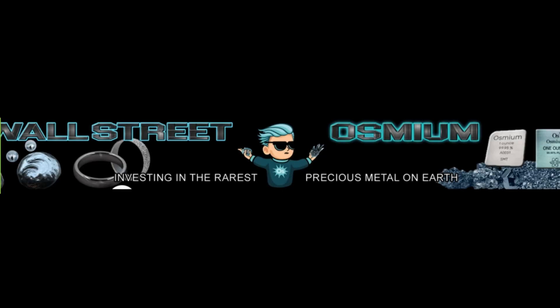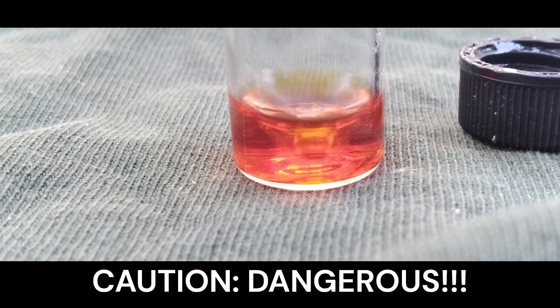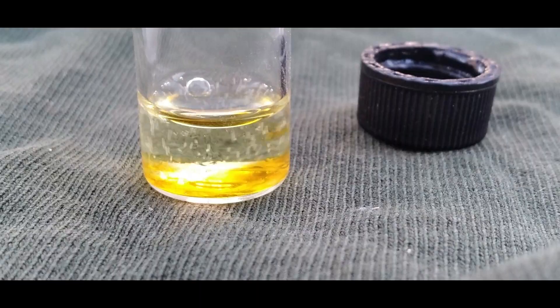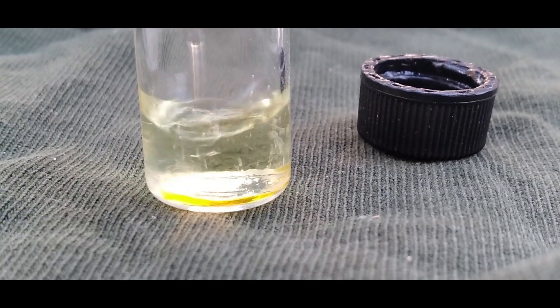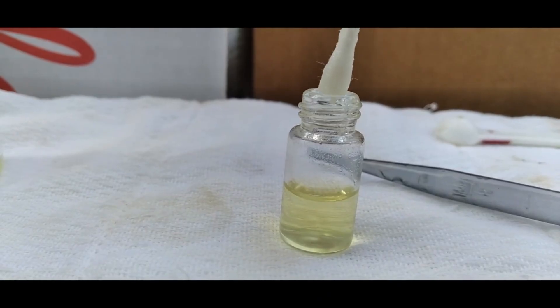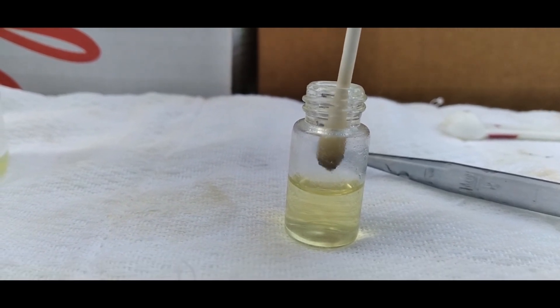Speaking of which, by far the easiest way to make osmium tetroxide is by adding hydrochloric acid to a solution of sodium osmate and bleach. The hydrochloric acid reacts with the bleach to produce chlorine, which in the presence of water oxidizes the osmate to osmium tetroxide. Once you've obtained this highly dangerous, volatile, yet surprisingly stable octavalent compound, you'll be granted a wide range of possibilities. It'll blind you if it gets in your eyes, and it'll destroy your lung tissue if you breathe it in, but it's really cool stuff.